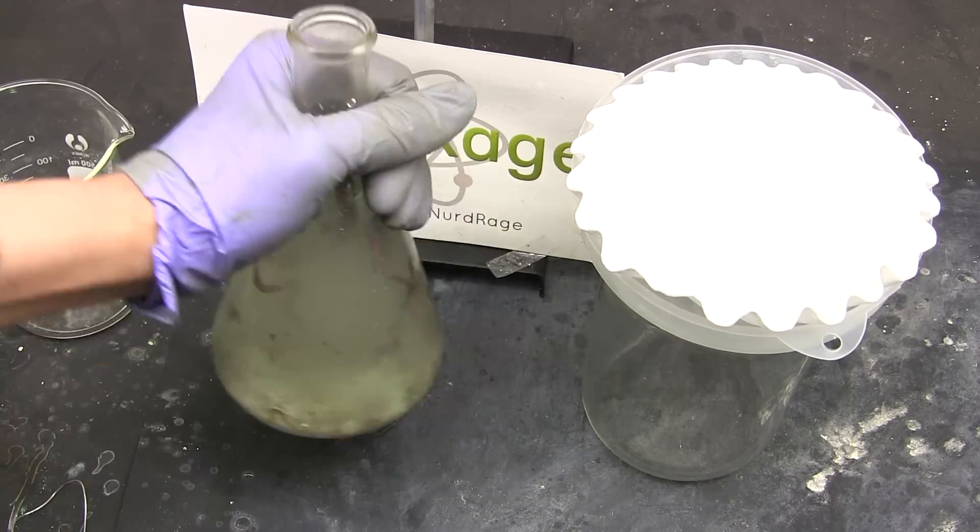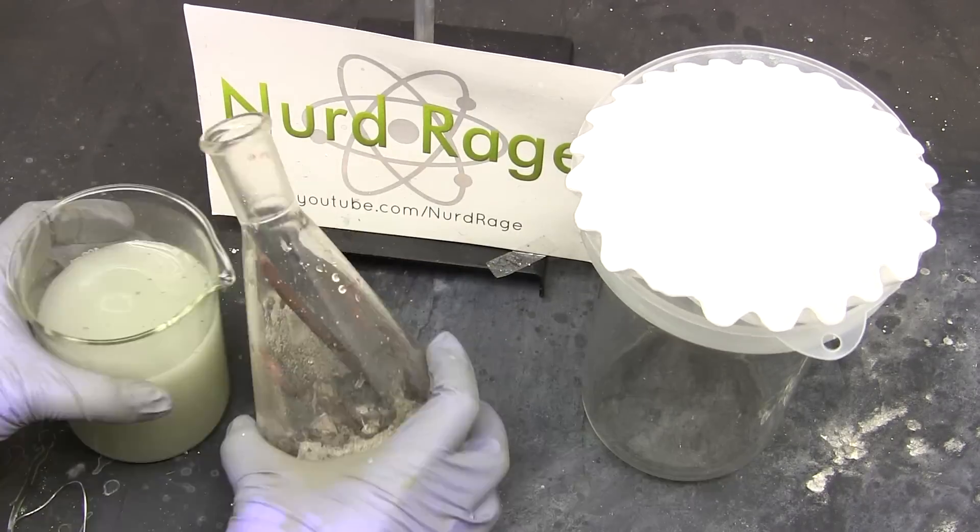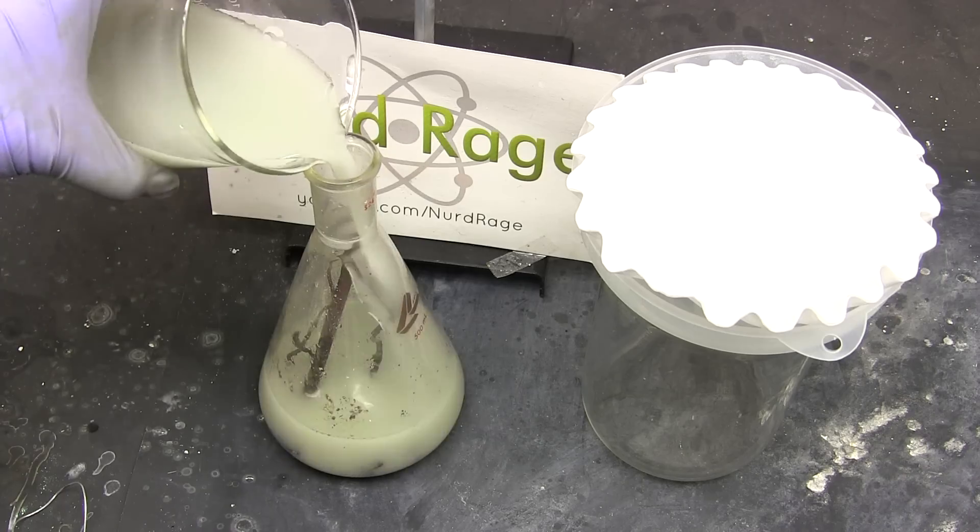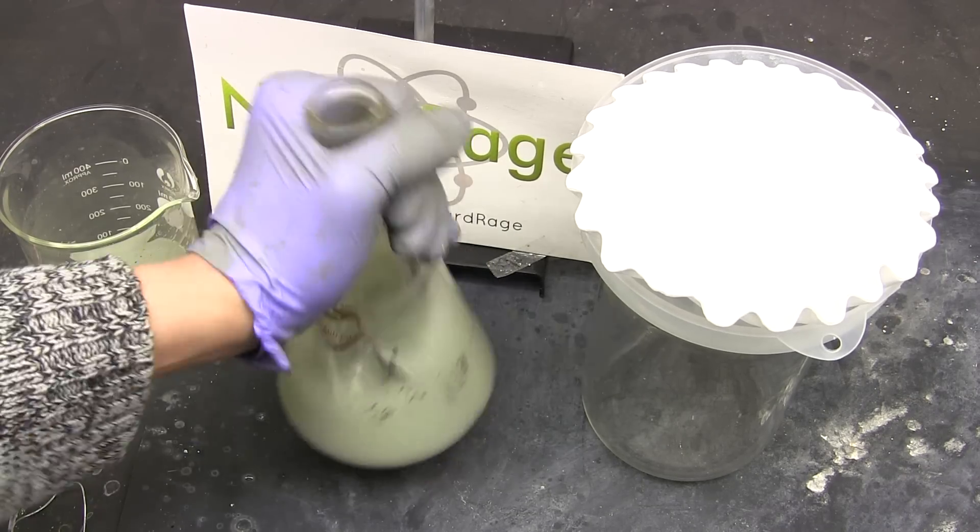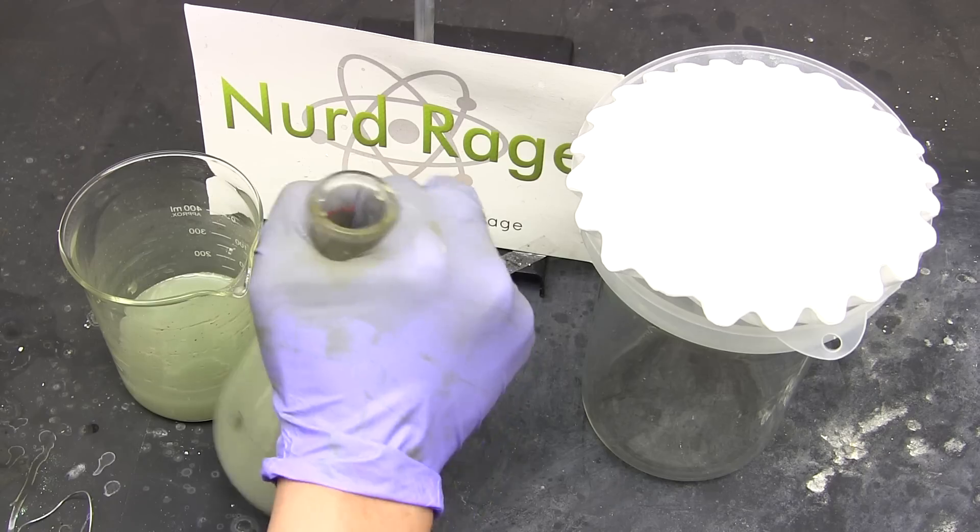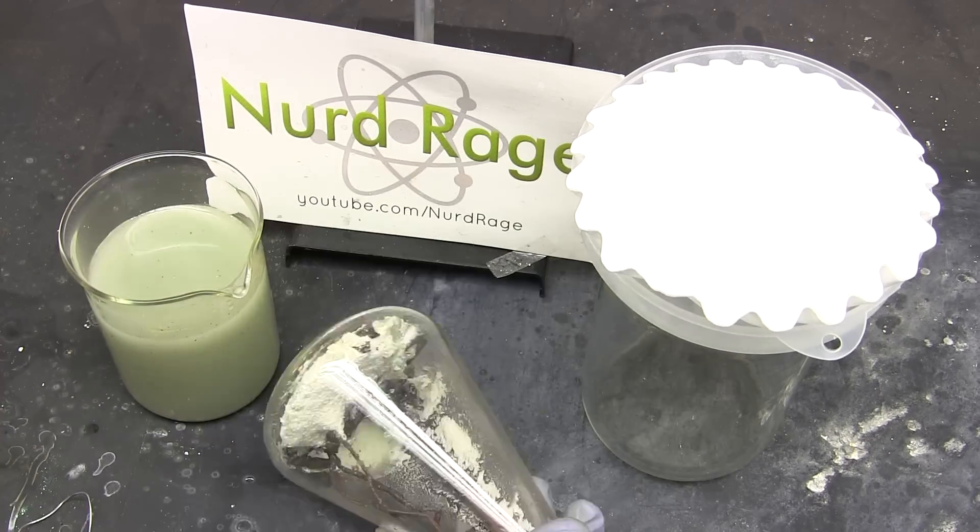Now take the residue and at least three times its mass of water. If you don't know the mass then don't worry, just add enough water to equal the original starting volume. The cake is fairly solid so you're going to have to shake it a lot to break it up. We're trying to dissolve the green iron 2 chloride and separate it from the insoluble copper 1 chloride.